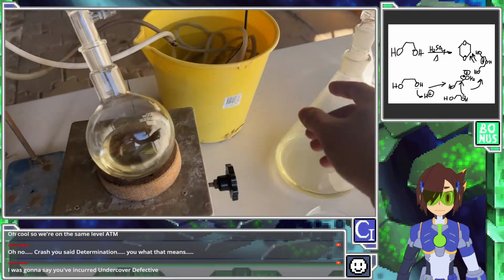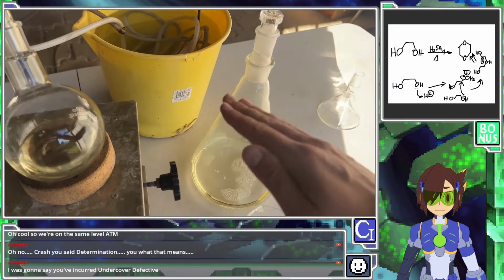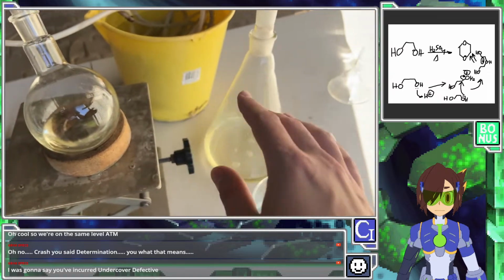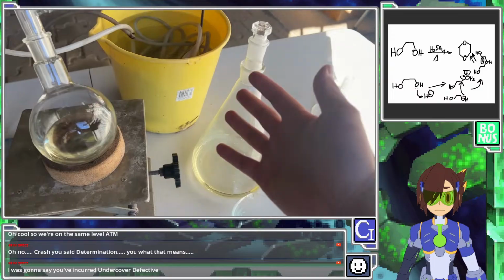The next step is to put in quite a bit of sodium hydroxide, which will separate the dioxane and the water and also polymerize a lot of impurities that are in there, like acetaldehyde, which is quite prevalent. Then the sulfuric acid that comes over is neutralized as well. That helps. Great. Okay, that's it. That's the whole update. Thank you.